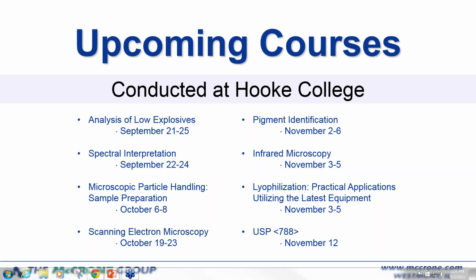Thanks, Kate. Question from James. If you were to examine a powder for homogeneity, would you consider using a pellet press to make it flat, or ATR? And if ATR, how do you address the limited sample size?